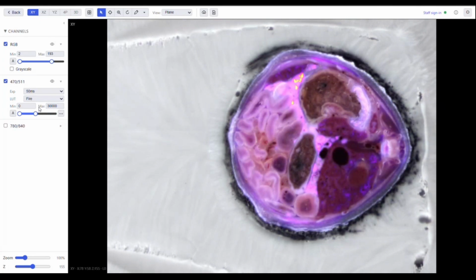If you also need finer control, you can narrow the slider range using the range settings below if you click on this expand tool. This will rescale your slider across your chosen range, making it easier to fine-tune the min-max values. For example, here our slider range is 0 to roughly 66,000. By changing the slider range here from 65,000 to 30,000, we can use the full slider to make finer adjustments within the range we're interested in.